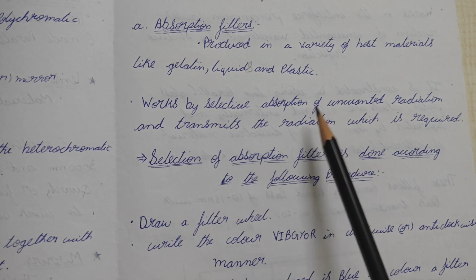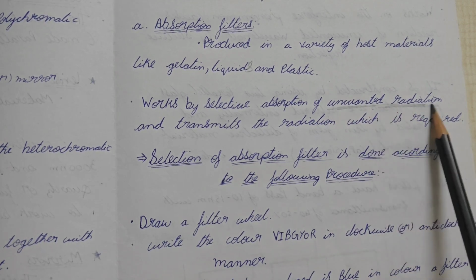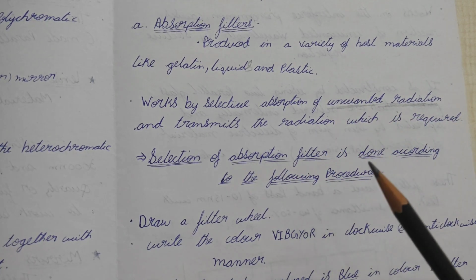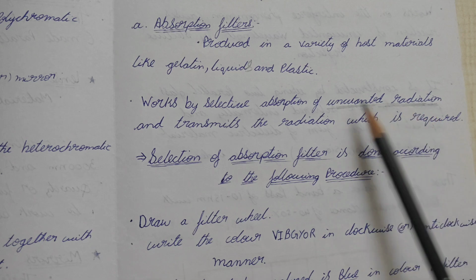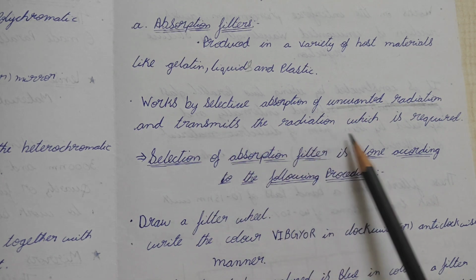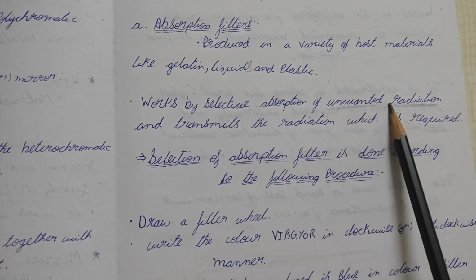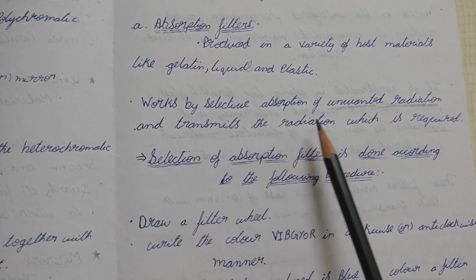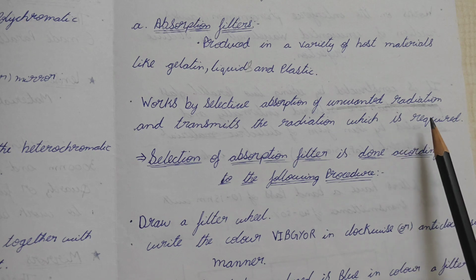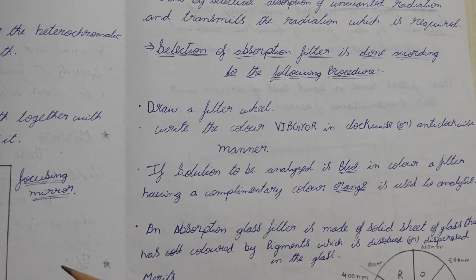It does not allow the unwanted radiation to pass through the filter. It only transmits the required radiation. That's the basic principle.